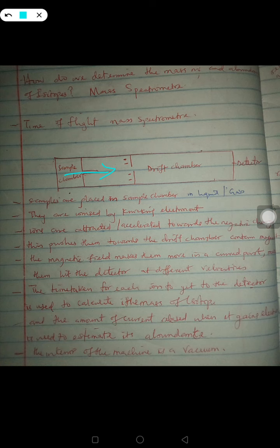Now that we understand the sample should be in those two forms, the next thing, after the sample is placed into the sample chamber, is that it is going to be ionized. Ionization, remember in chemistry, is the loss or gain of electron. But in this case, we are ionizing the sample by losing electron. As the particles are evaporated here, there will be release of electron. This chamber contains some filament that can radiate electron.